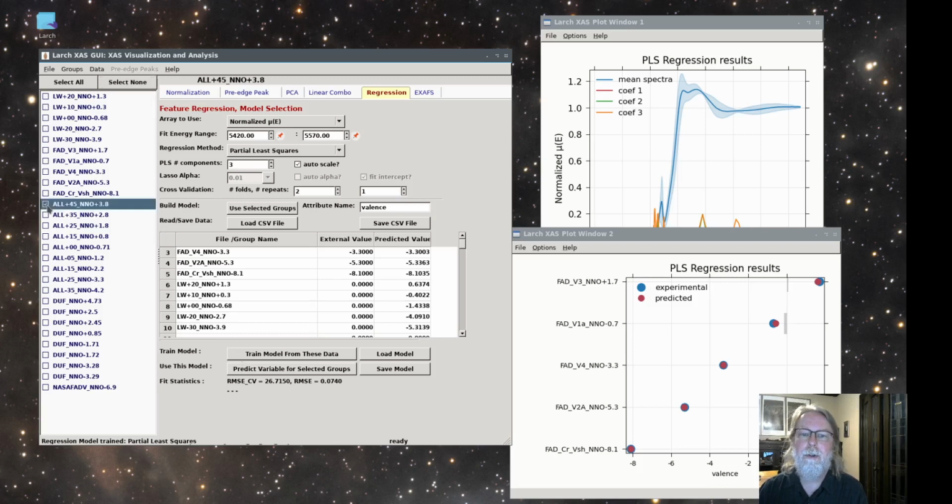So just out of curiosity, let's go try some of the other samples. I can just select none above this. Let's just try it for all of them. Now that we've trained this, we trained with, I should say, 5 data sets, and we're going to predict 20 or so. And while it's training the model, it does cross-validation. So it'll take 1 or 2 out, replace it, see if it predicts it. It'll do all of those steps to make sure that the data is cross-correlated and so on correctly.